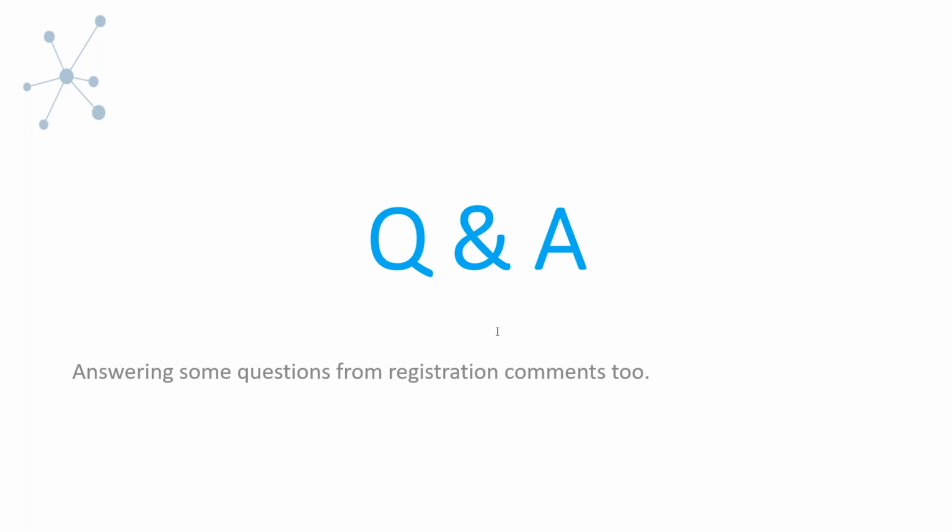So in case you're not familiar, so obviously the person asking the question understands, but just for the general audience, thixotropy is really a time dependence in terms of restructuring of a fluid. So, one misconception that exists is that thixotropy is equivalent to shear thinning, and that's not quite true. So thixotropic materials will shear thin, but there's more to the story in that case.